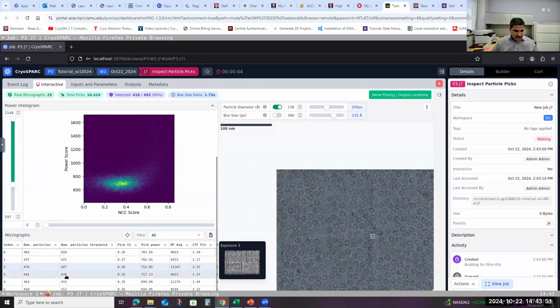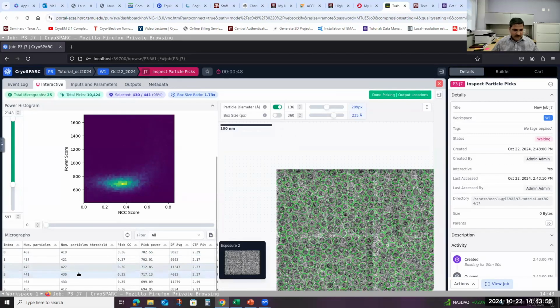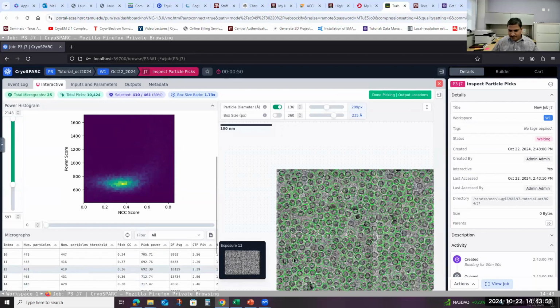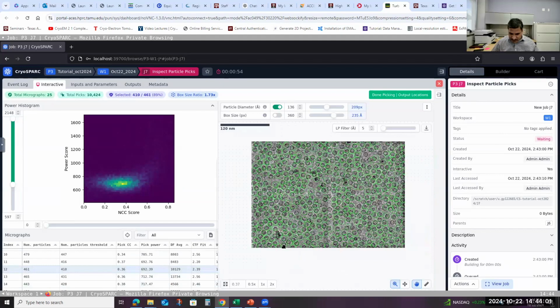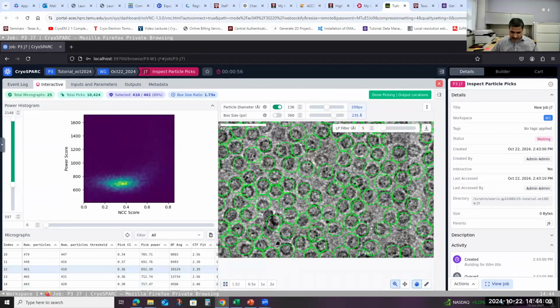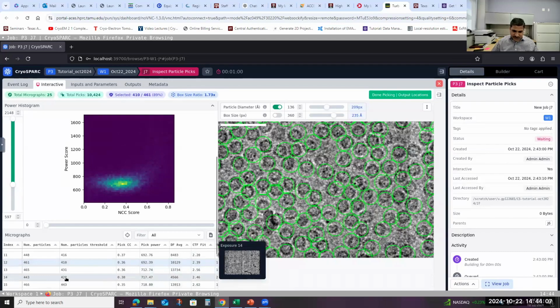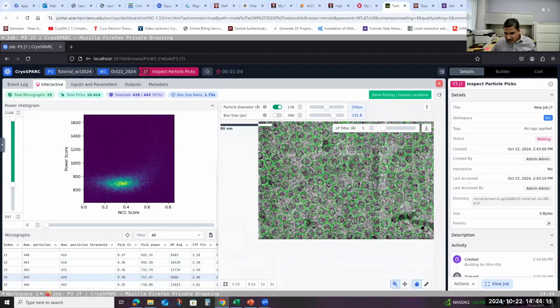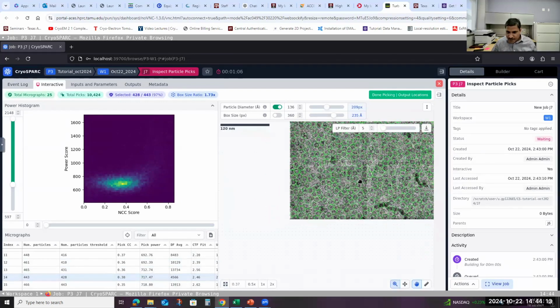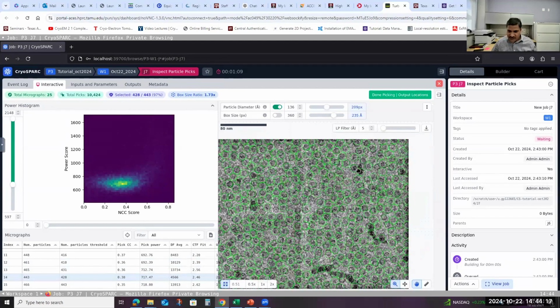You can also try to change to a different micrograph, to see whether it looks good for every one or just for one. And then another thing we need to find, let's see whether I can find. You see that there are some dark spots, even though it's a cluster of multiple particles set together. But let's say this is ice.